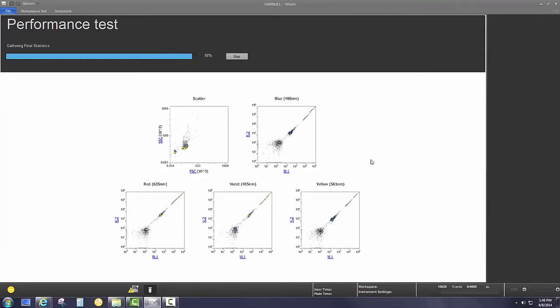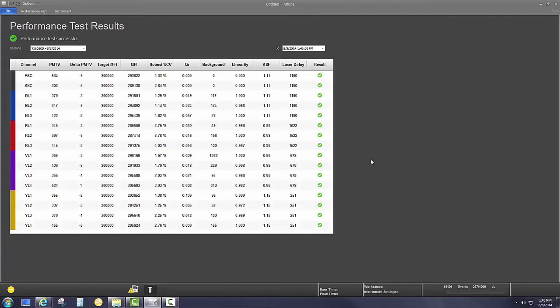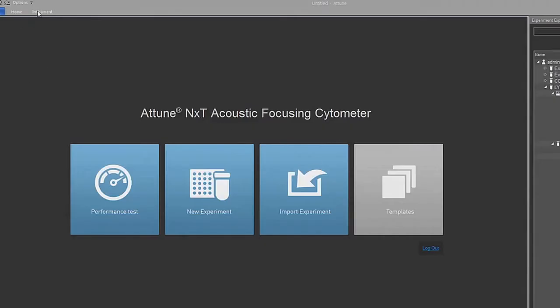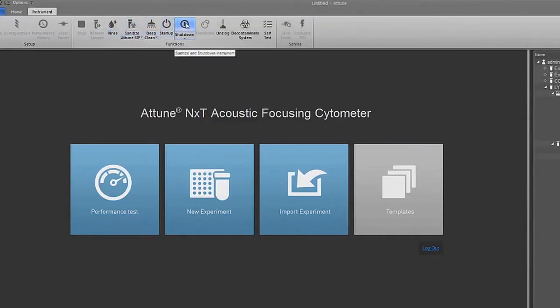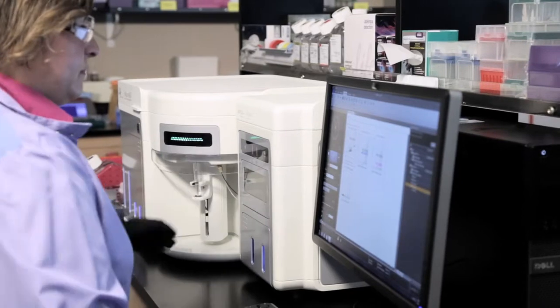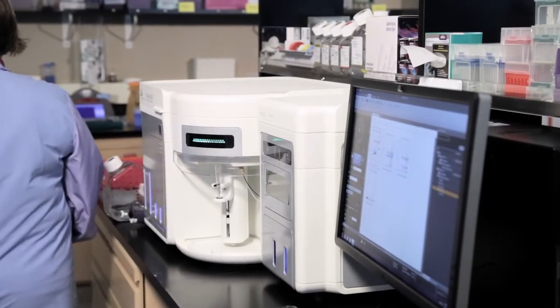After initiating, you can work on something else and return to view a full report. And when it comes time to shut down at the end of the day, just initiate the shutdown cycle and you're done. Just walk away. The system completes cleaning and will shut down automatically. This allows you to save your time for what is important.